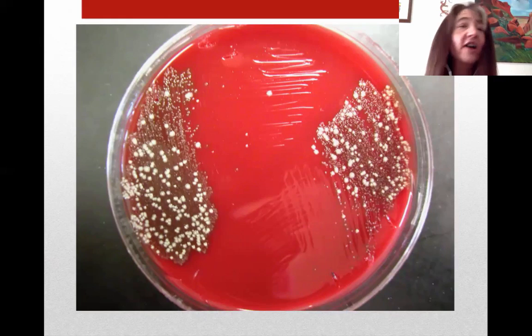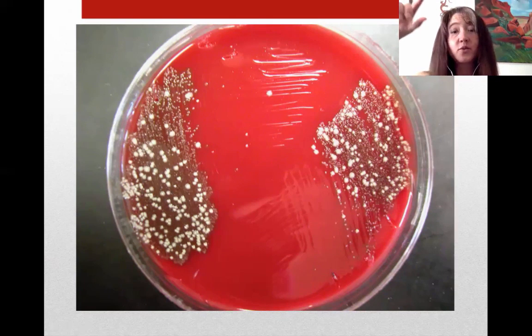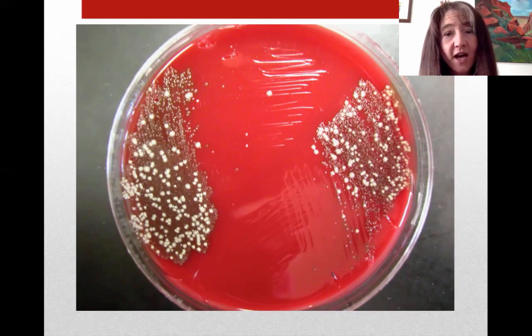And we're seeing a lot of alpha hemolysis. Remember, that is the green, kind of opaque-looking zones. We're also seeing a little bit of gamma hemolysis. In fact, there are some little colonies here where you can't see any type of zone around them at all. Even the larger colonies look like they're not showing much of a zone. Of course, you would also want to hold this throat swab up to the ceiling so that you could see through the light whether or not your organisms are forming any kinds of zones of hemolysis.